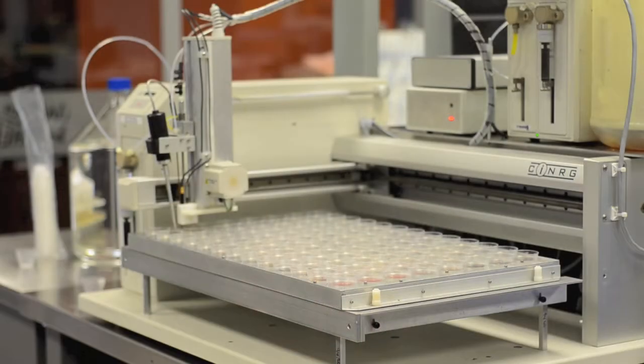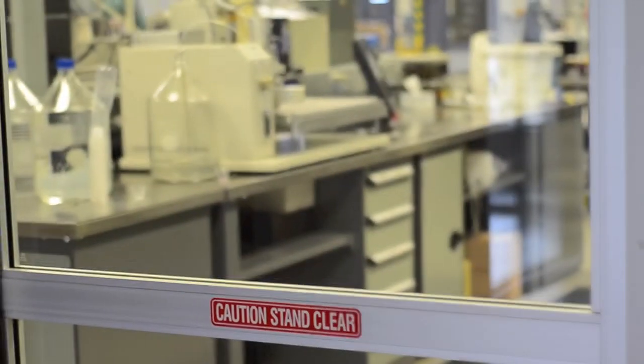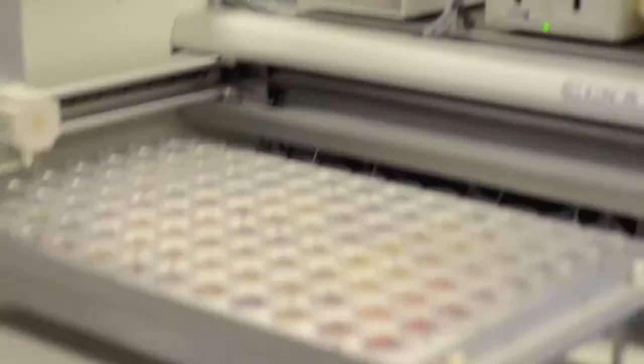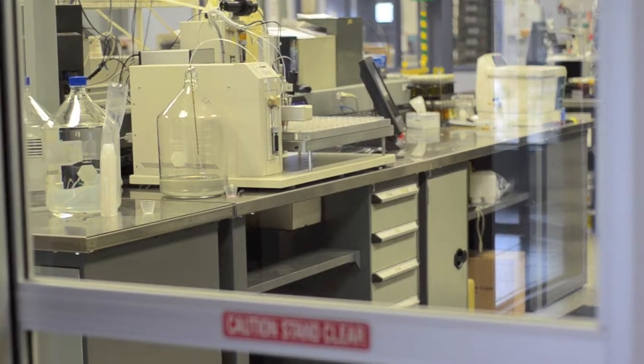The Synergy CSEPC2 Auto Dilution Particle Counter was designed for commercial oil analysis laboratories. The CSEPC2's high level of automation coupled with a large 104 position sample tray and a high level of accuracy make the CSEPC2 a welcome instrument in any modern oil analysis laboratory.